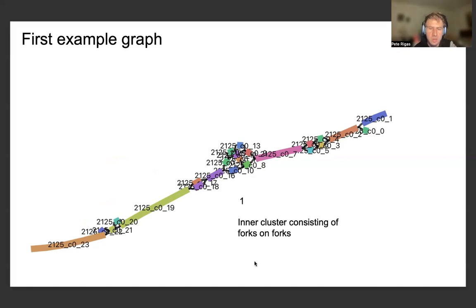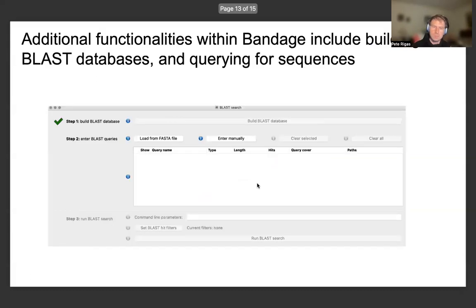But in the middle part of the graph, there are more nodes which have higher degrees, and they almost form a cluster consisting of different possibilities for the middle parts of the sequences, which can help us combinatorially realize and interpret different possibilities for many of the sequences generated by the transcriptome assembly.